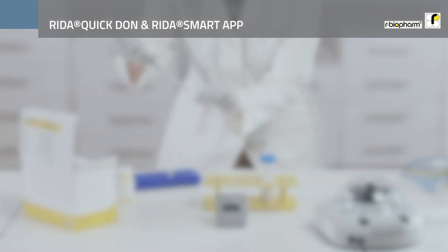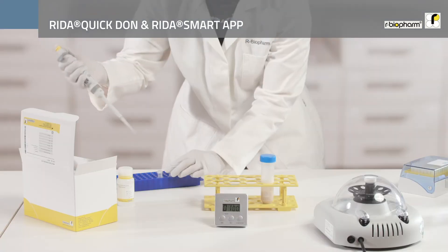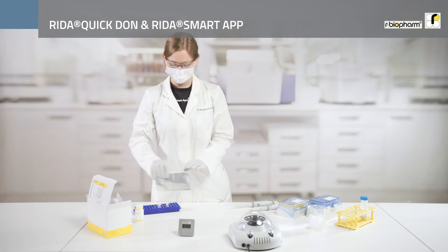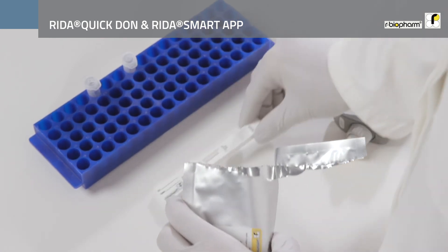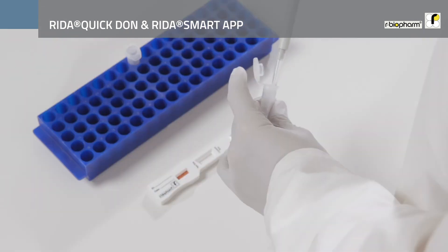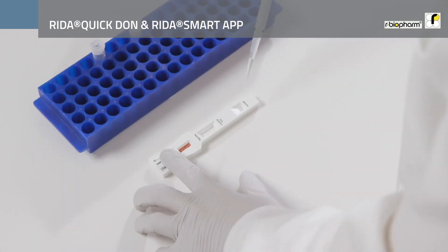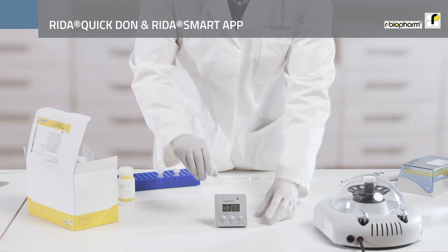Then pipette 100 µl of Dilution 1 onto the application area of the test strip and incubate the test strip for 3 minutes at room temperature.